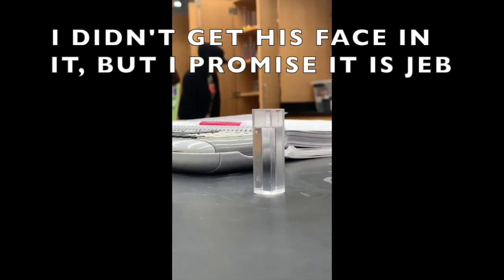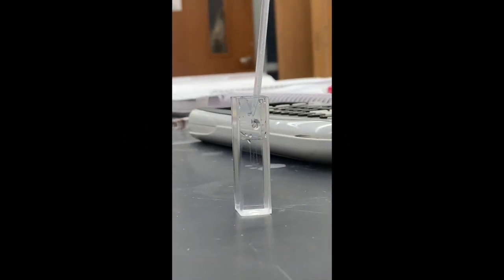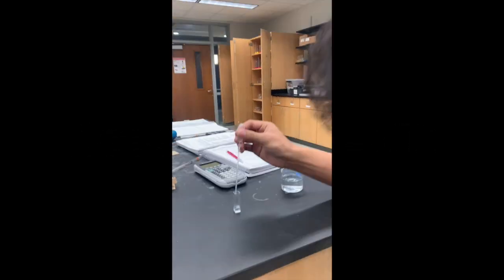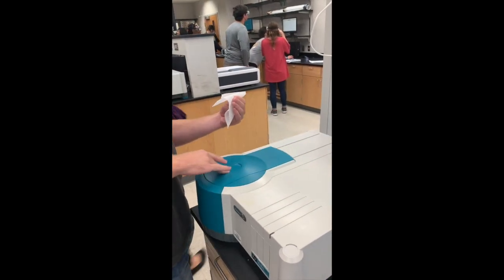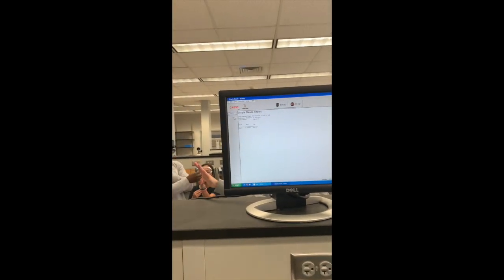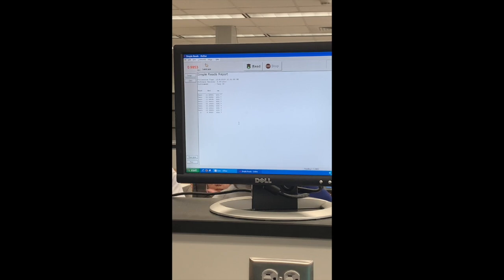Oh, Gucci gang! Come on, Spitzer. One more drop, one more drop. Alright, beautiful. I'm gonna start transferring. Oh, is it good? It's good. Ooh, beautiful. Nice.